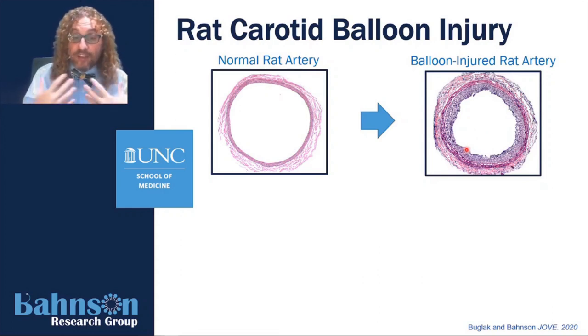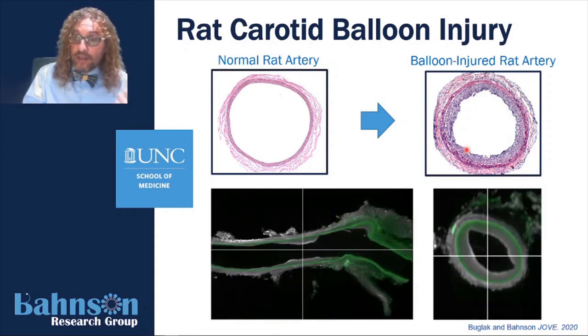I told you in the title that in the lab we study this by 3D, and I'm going to go into detail later in the presentation. But here I'm showing you a longitudinal view of a common carotid, and here's a bifurcation of external and internal. And we can see the hyperplastic lesion here, and this is a cross-section where you see the same thing.